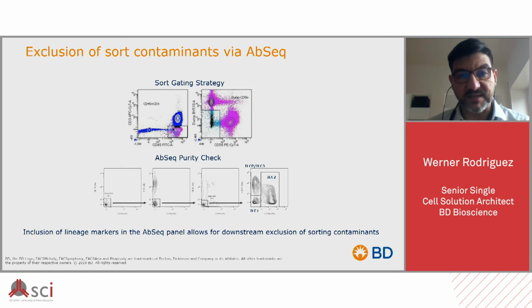It presented some specificities that were not as desired. So at the end, as you can see in the far right diagram, we were able to characterize the three major groups: ILC2, ILC1, and ILC progenitors, or ILC3.